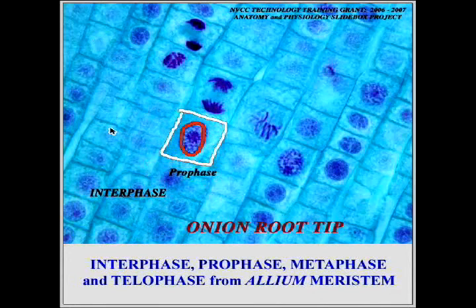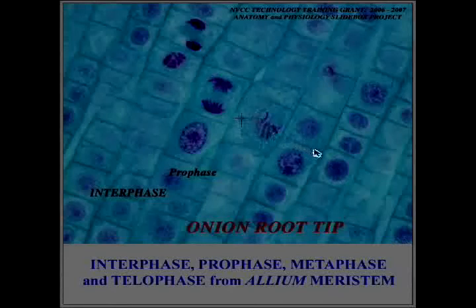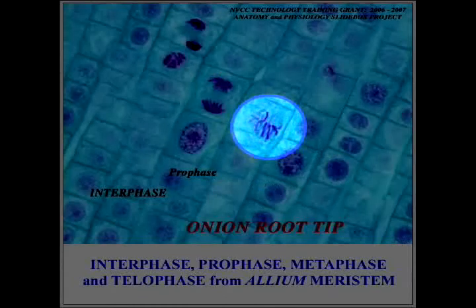If you look at this point over here, the chromosomes are actually lining up on what is referred to as the metaphase plate. Now, the metaphase plate may not be apparent to you right here, but in fact, the metaphase plate runs somewhere down about so. And along that line that I just drew, you have the centromeres of the individual chromosomes lined up along that area.